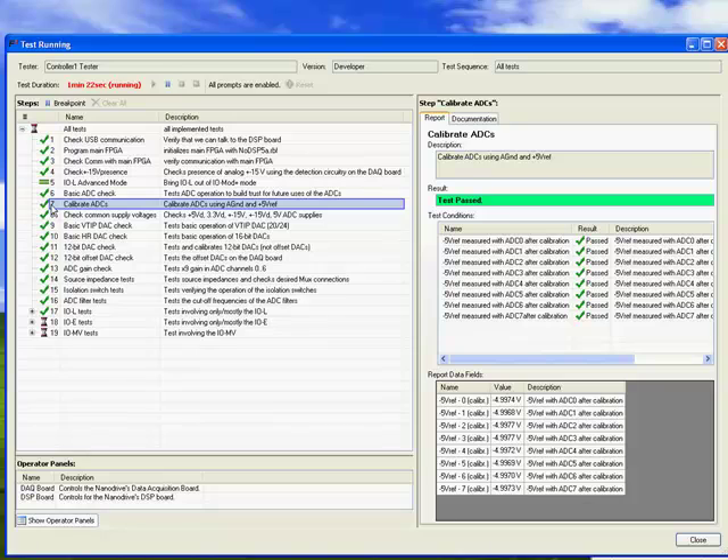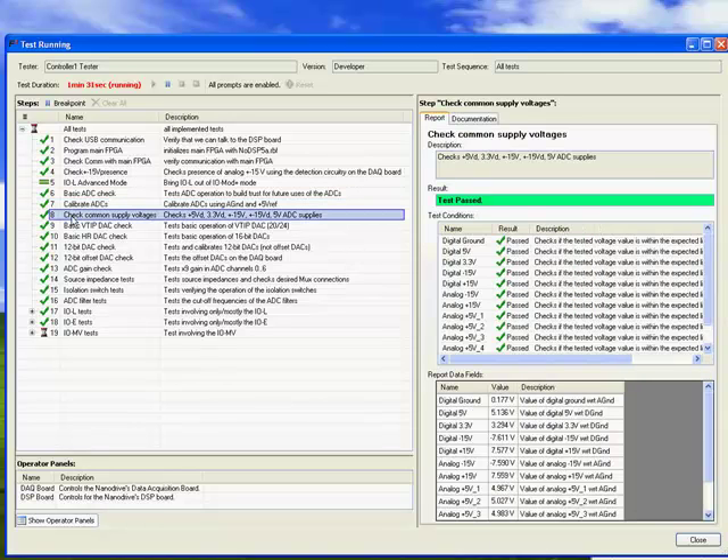If you want to find out what exactly these tests are doing, you can extend the window and when you click on a line item, you get a description of what test is being executed along with the detailed test results.